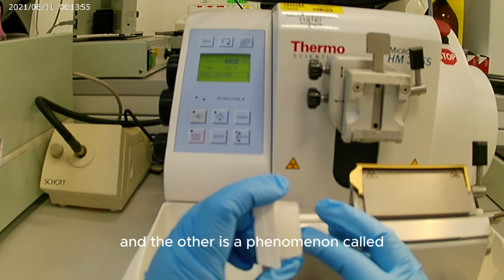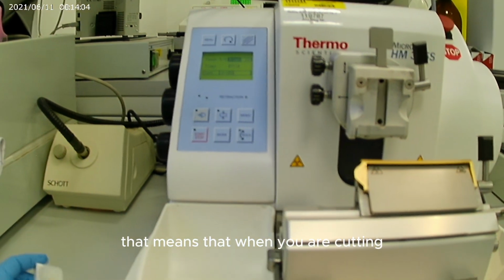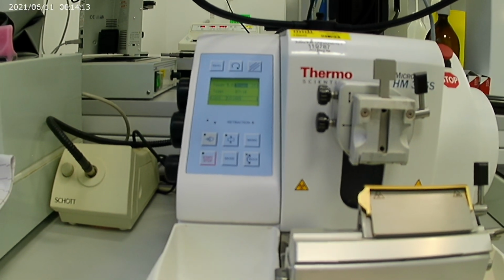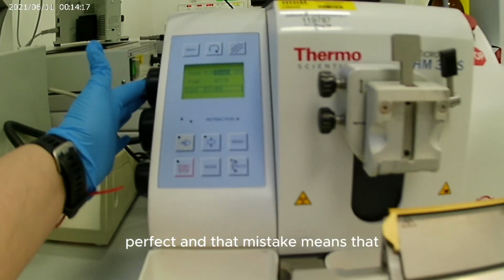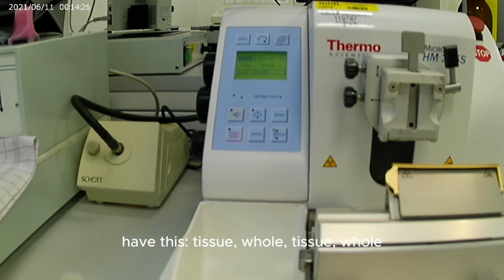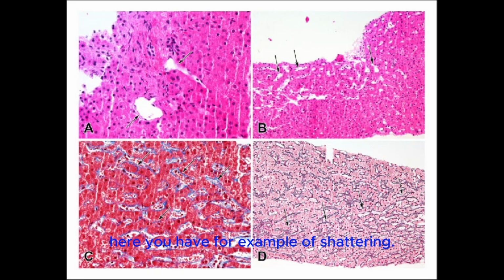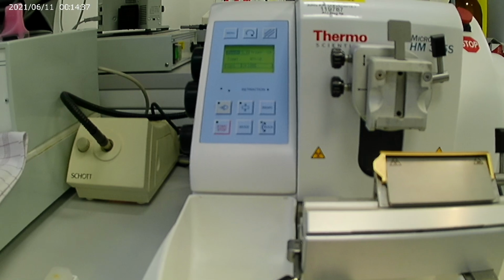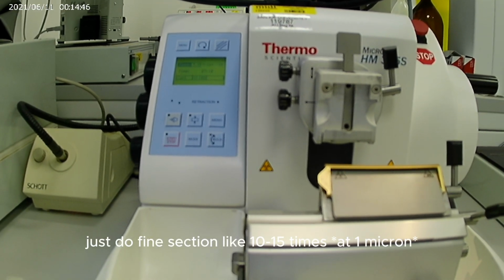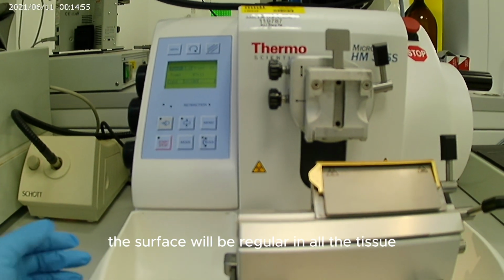And the other is a phenomenon called shattering. That means that when you are cutting at a lot of microns, the surface of the block will not be perfect, and the tissue will be broken and you will have this tissue hole in all the section, like the waves on the sea, and the surface will not be regular. Here you have an example of shattering. To correct that, if you did the trimming at more than 10 microns, just do fine sections 10-15 times, and then you will be sure the surface will be regular in all the tissue.